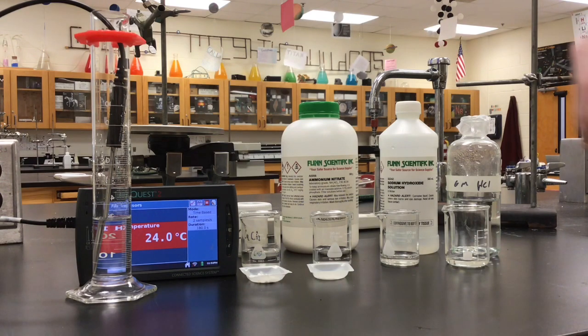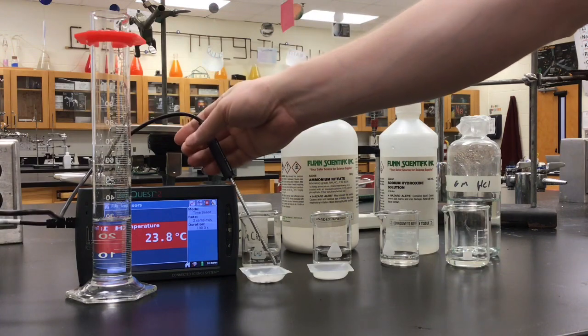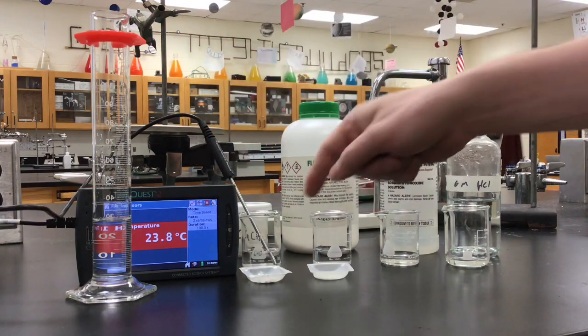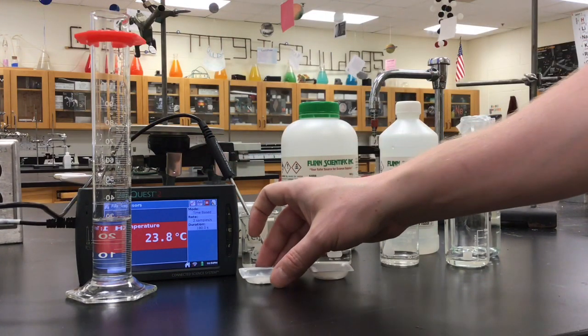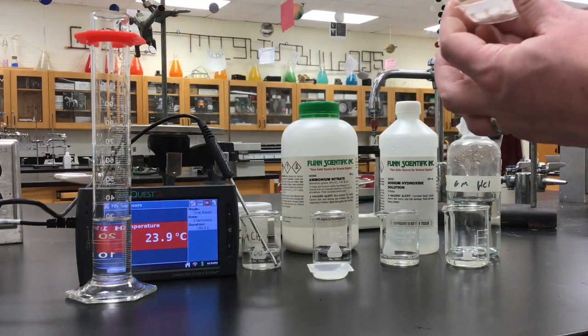The first reaction we're going to do is we are going to dissolve 1 gram in 20 milliliters of water. This is 1 gram of calcium chloride. Let's take a look at that temperature and see what it does.